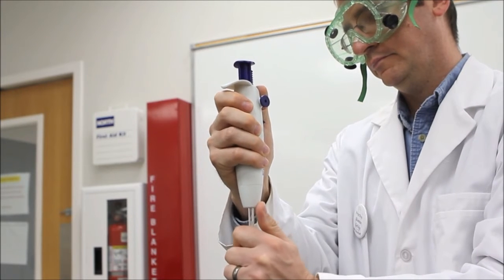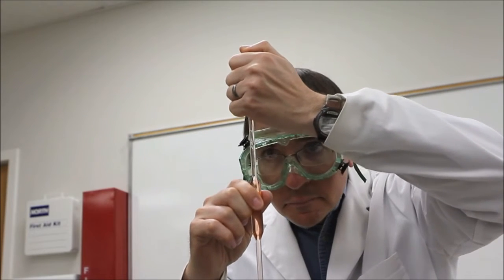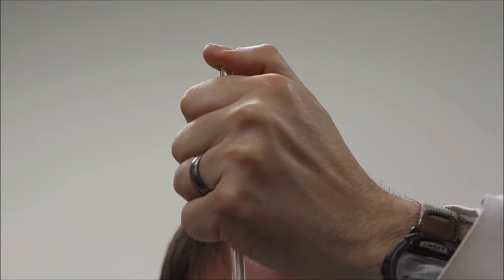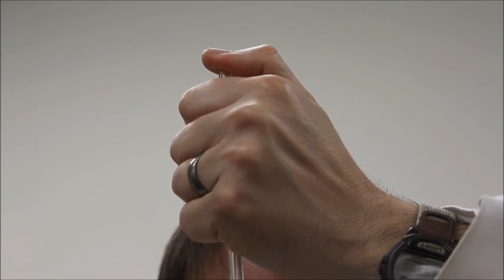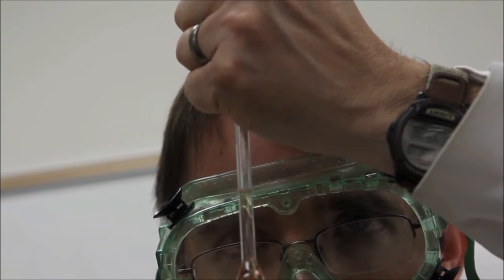Remove the pipette pump with one hand and immediately cover the mouth of the pipette with your thumb or forefinger of the other hand. Keeping pressure on the pipette mouth, raise the pipette so the etch mark is at eye level. Carefully control the pressure exerted by your thumb to slowly drop the liquid level until its meniscus is exactly even with the etch mark.